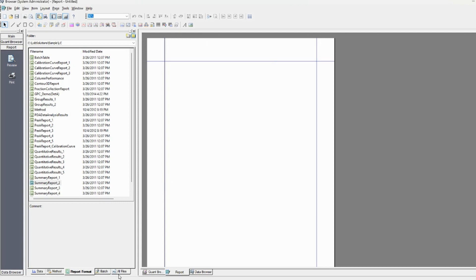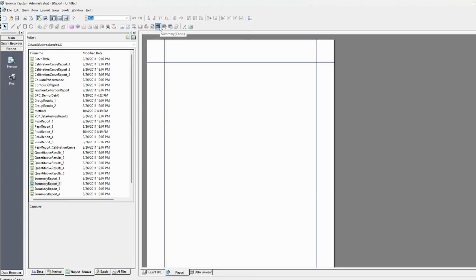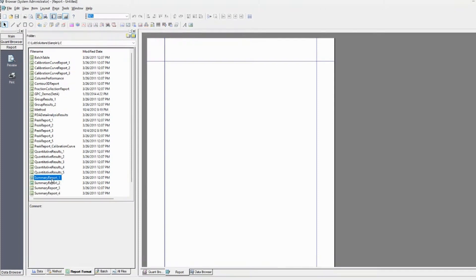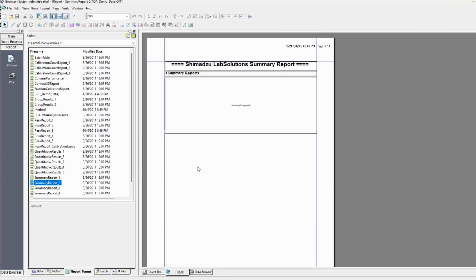In order to get all the compounds for all the analytes on one page, there's little icons up here. The one that you want is called summary compound. I believe it's also one of these reports over here that's pre-made. I think it might be report two.